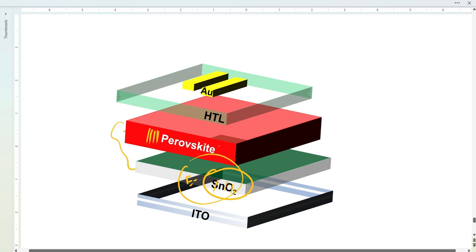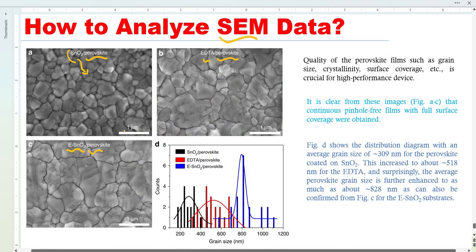When we simply deposit perovskite on tin oxide, we can see the grain sizes are smaller. We can see there are a lot of grains, smaller grains, and we know that small grains produce... do you know what?